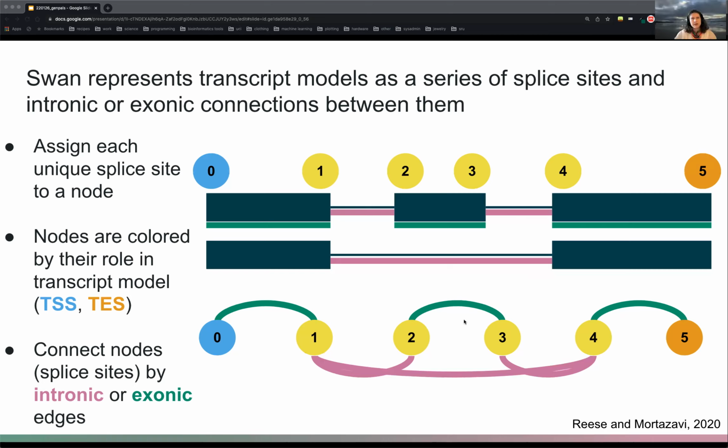So basically, as an output from Talon, you get a GTF transcriptome of all the transcripts that are seen in your data. And that is a combination of taking what is in the reference, as well as identifying what is new compared to the reference, and coming up with these novel transcript structures based on where the splicing occurs within the reads as well.